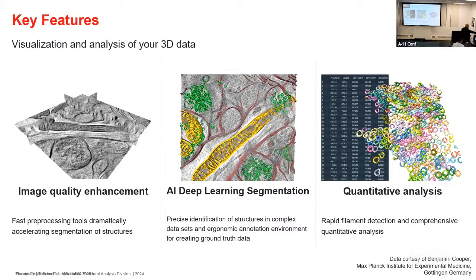There's a speaker there. Have you guys tried any unsupervised methods where you just give it the image and let the model tease out what the different features are? Because I guess data annotation, especially for creating good label data, takes a non-trivial amount of time to do. Speaking from personal experience.